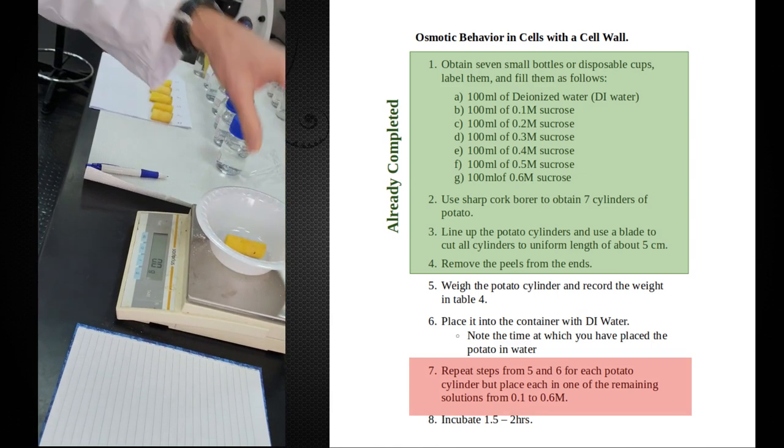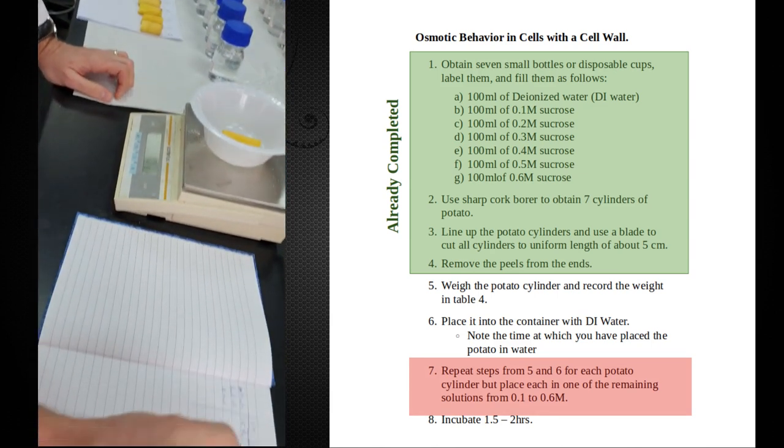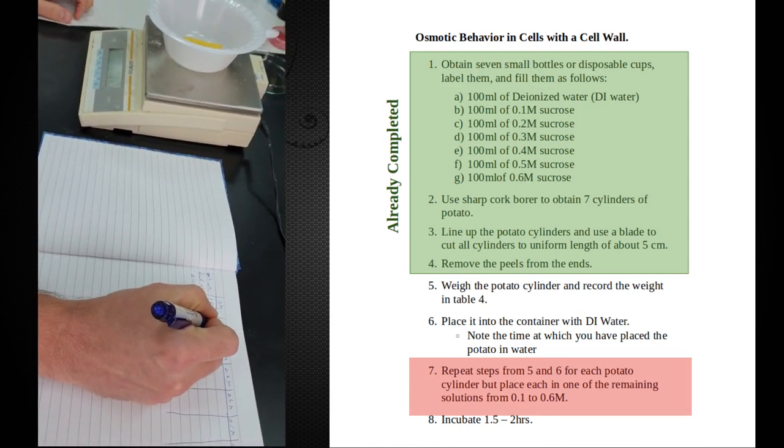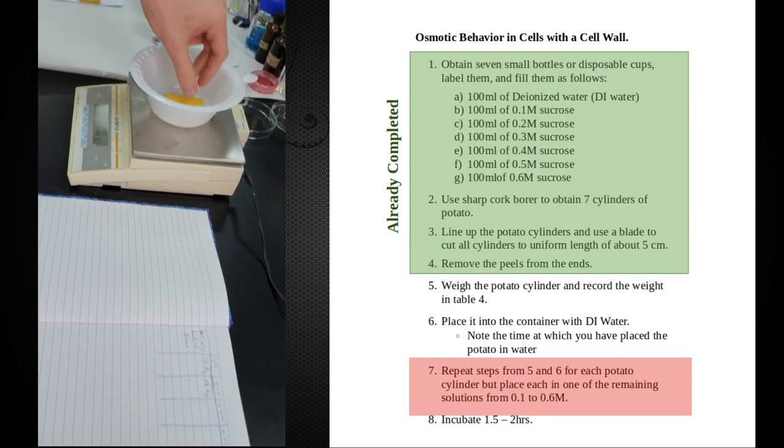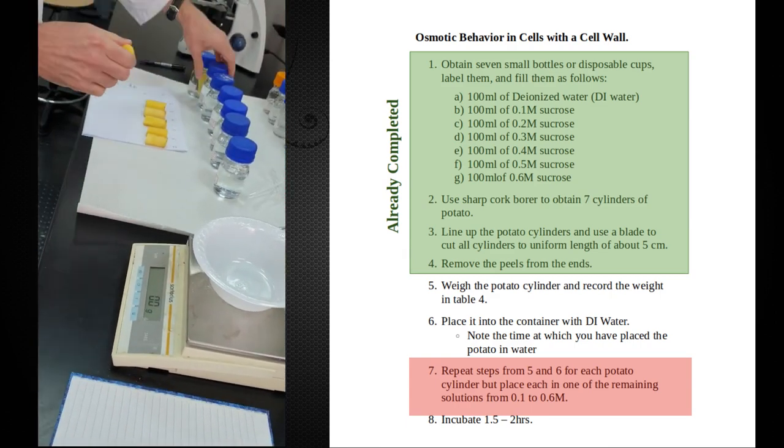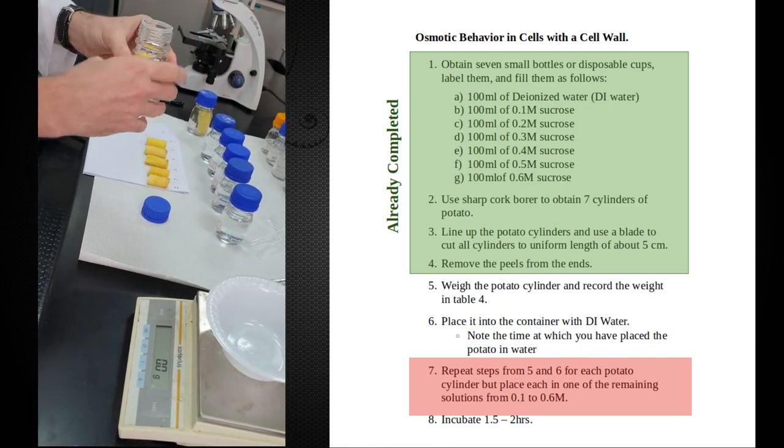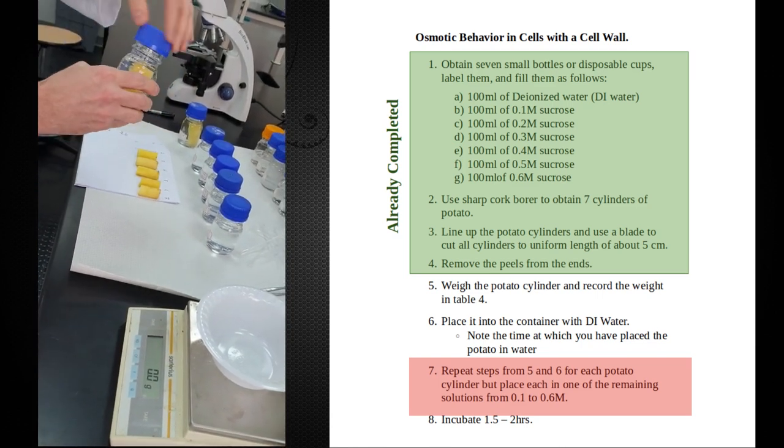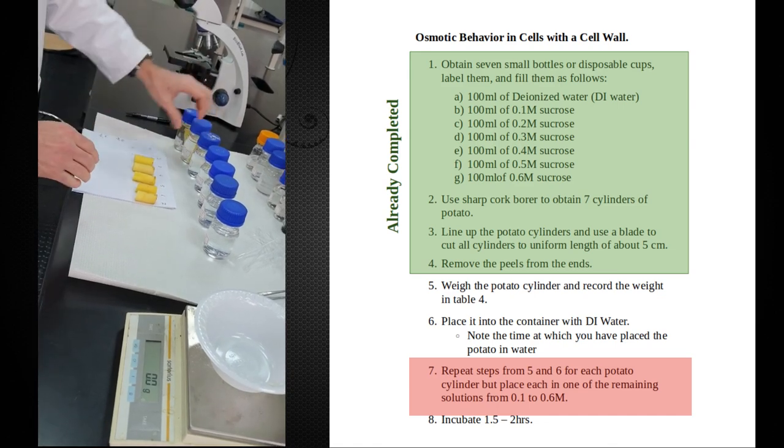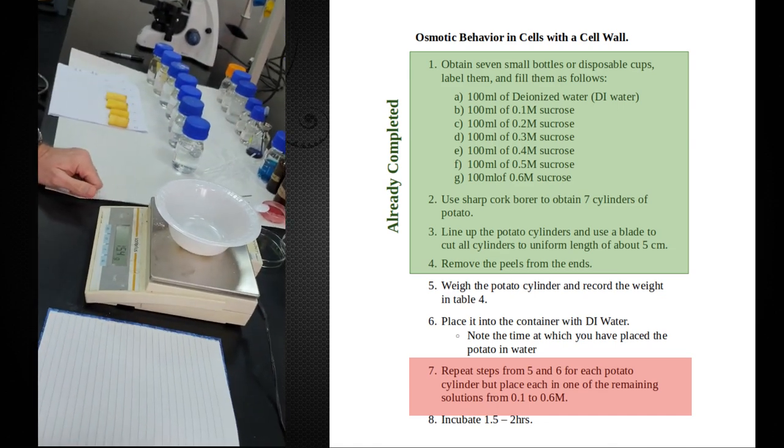Now let's take potato number two, which has 17.0 grams, and we'll place that into the second bottle. So always keep track of these things. Don't mix them up. Don't just weigh them and just leave them on a piece of paper or something. Just weigh them and put them directly into the bottles.